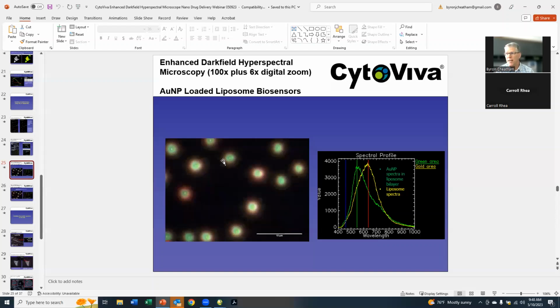Even if I apply a decent molar weight of PEG, you mentioned gold nanoparticles, for example, which also can be used as a drug delivery vector. They also can be used for photothermal therapy. Even if I put a decent molar weight of PEG for biocompatibility on a gold nanoparticle, what I'm in effect doing is that the active pharmaceutical ingredient or the functional group, in the case of the PEG, is changing the way that the nanoparticle interacts with light and changing its optical spectrum.